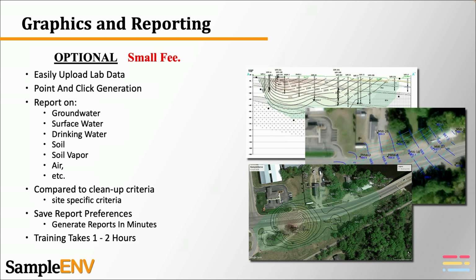Training on the reporting functionality is pretty simple. If a user has any experience at all in preparing environmental reports, most of those users will learn how to use this reporting software in under 2 hours. As mentioned, we do charge a small fee for the reporting service. Use of the reporting services is not required, and the field data and sample collection applications can still be used at no cost.